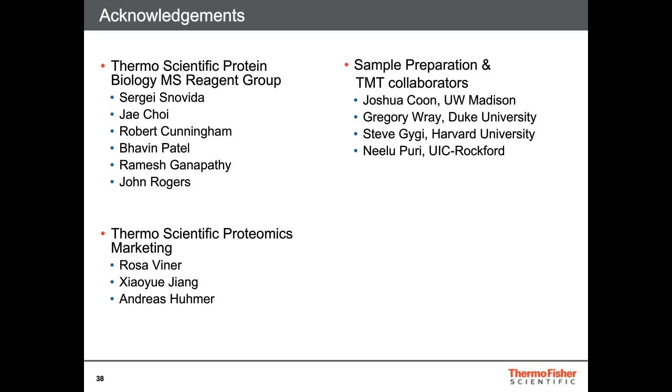Okay. This one has to do with software. I'm running an experiment for 200 plus samples and will be using TMT quantitation. Do you have a suggested software for the statistical analysis of these samples, as Proteome Discoverer 2.1 doesn't support this form of analysis?